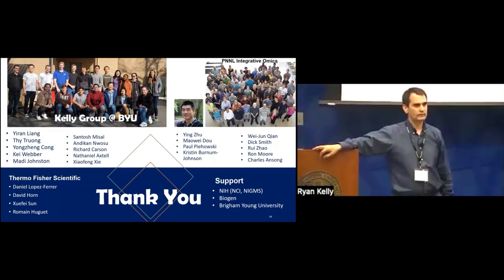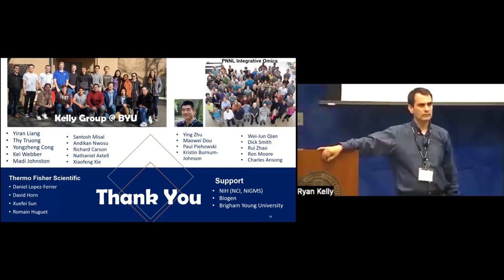Right. And the second point, I mean, your idea of generating these two-organism data sets, would it be possible to generate single cell data mixing, say, yeast or E. coli in human, where in one experiment you generate different organisms, and then you start doing match between runs? Because you've got to generate some realistic data sets in this scenario, right?